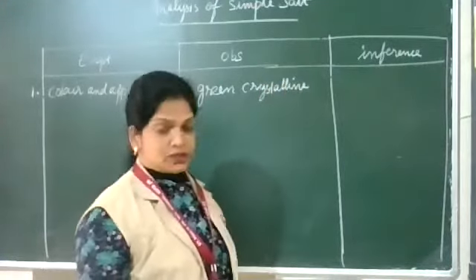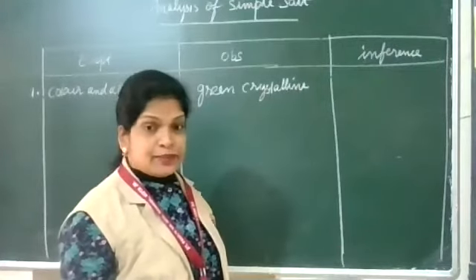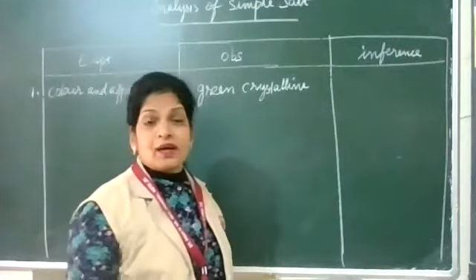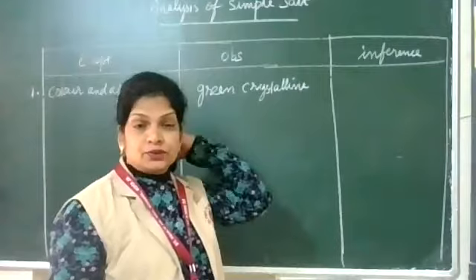So we have a doubt. If it is green, maybe Ni2+, or it may be copper carbonate. Copper carbonate is also a greenish color. So we doubt.